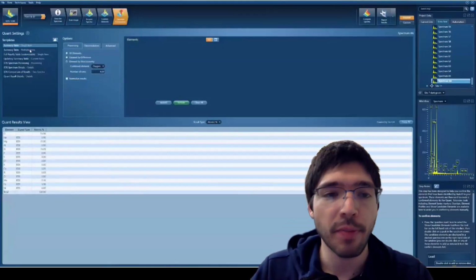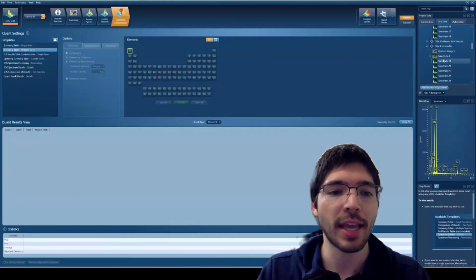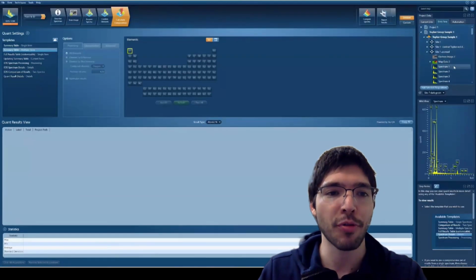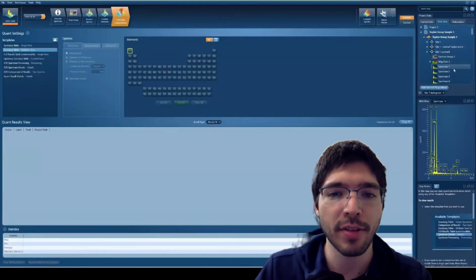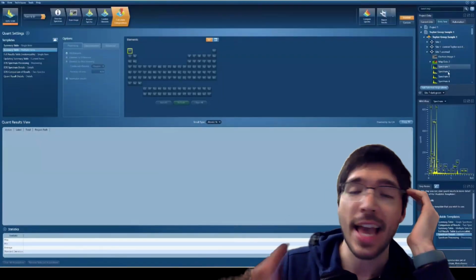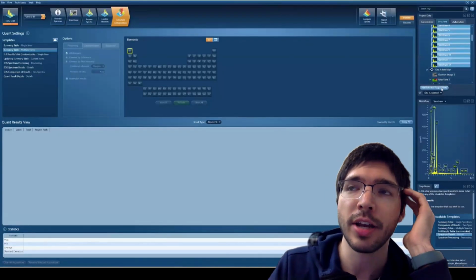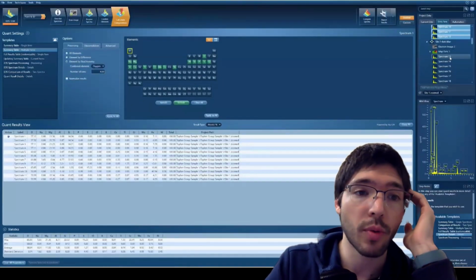Anyone who's looking at iron meteorites, what they're doing is a completely different process. They're essentially just taking apart an iron meteorite, dissolving it in acid, and then measuring trace element concentrations. For reference, the lowest detection limit that I can get for an element with pretty good precision is probably about 0.1 weight percent.